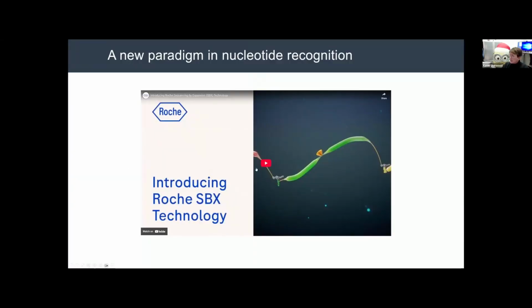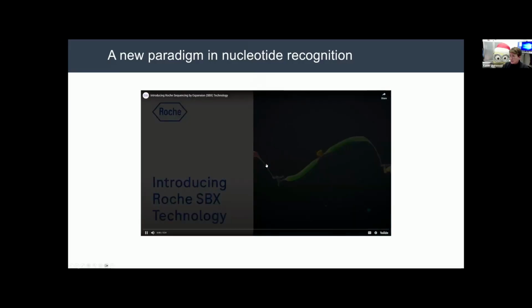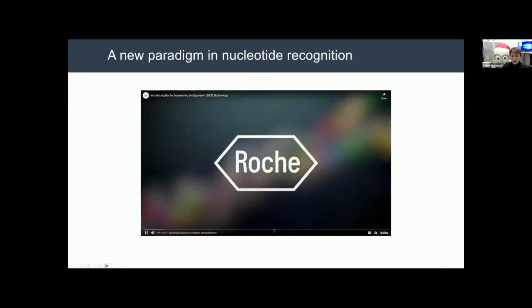So I'm hoping this video will work. It's just a very short video on SBX. I don't know if many of you are familiar with sequencing by expansion. It's an entirely new paradigm in nucleotide recognition. So I'll just play this. I hope you can hear it.